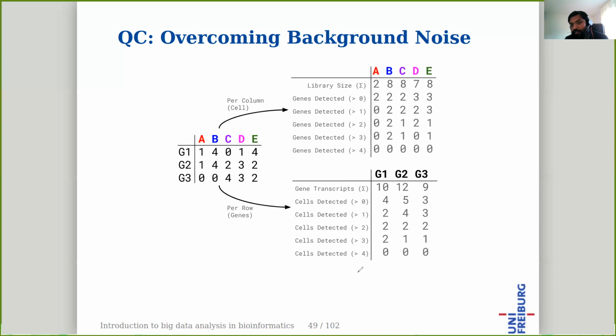And then we do this for different thresholds. And then we sensitively choose, depending on how many cells you expect. We just plot it, and then we see whether they are extreme outliers, and then see, okay, these are not fitting into the majority of the distribution of the cells or genes, and then we just throw this out by some cutoff. So that's how the cells are filtered. That's a common quality control that is usually done before proceeding.